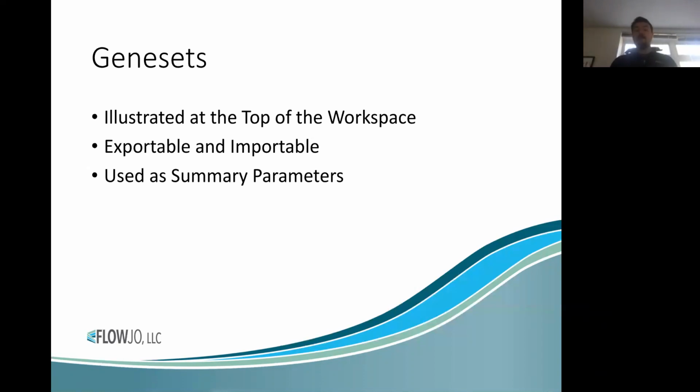And the whole purpose of that list is to combine gene sets, genes that are in some way similar. They might be upregulated for a given population. They might simply be dividing up your different omics analyses, like I had mentioned in a previous data set that we looked at where we have antibody parameters as well as RNA parameters. We might want different gene sets to distinguish the two. So they have a lot of different uses, but they basically combine different genes that make sense to categorize that way. There's also collections of gene sets.